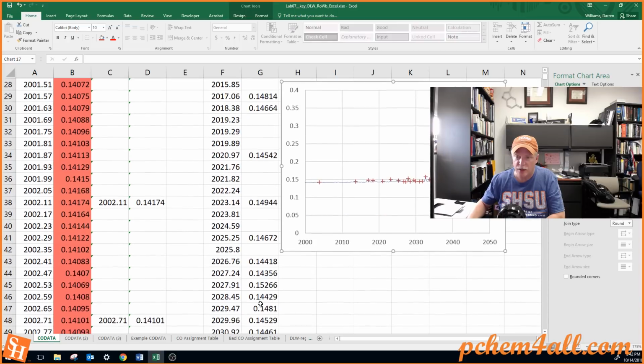And I will come back later on with a particular plot after I've done this, and you'll see how we can clean this up even further.